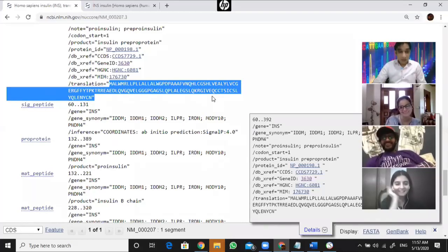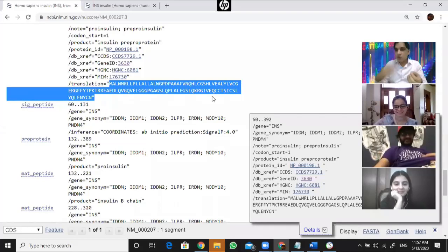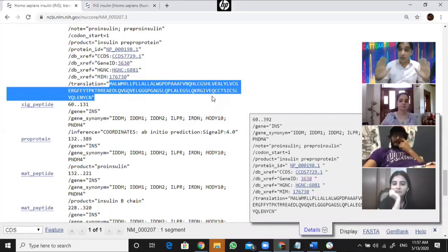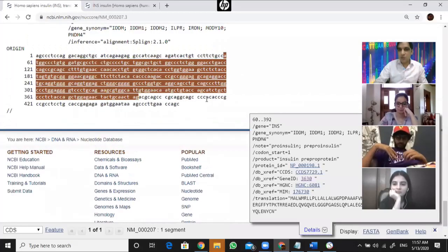So this is the protein sequence. You should keep that sequence as well. For what? Because if somebody asks you, your professor is so furious, how many base pairs, how many kilodaltons of protein will be made, or just let me know how many amino acids are there. You should have the specific record of your work with you always. You should be ready. You should be the one who knows everything about your product, about your research. But for now, let's talk about this sequence.